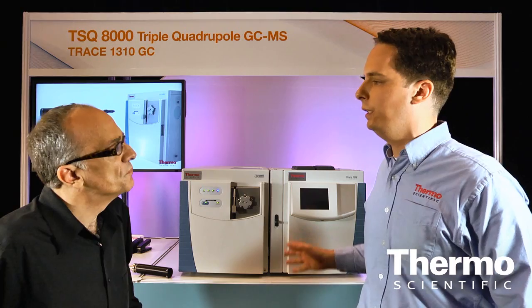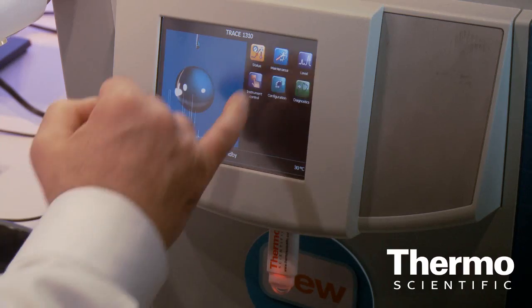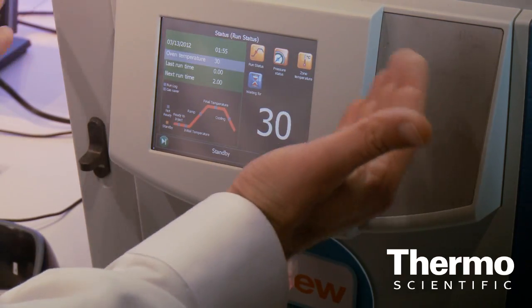We have this paired with the Trace 1300 or 1310 gas chromatograph. The GC is a very easy to use and very flexible GC. It features a touch screen interface, making it very easy to set oven program temperatures and injector temperatures.